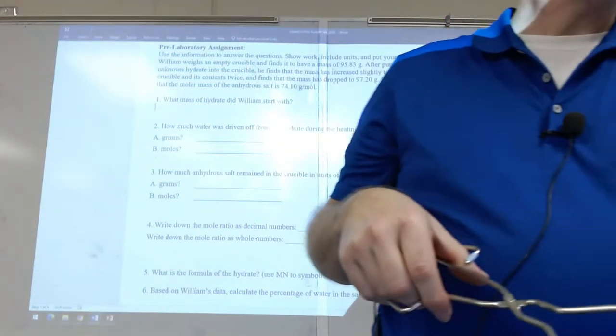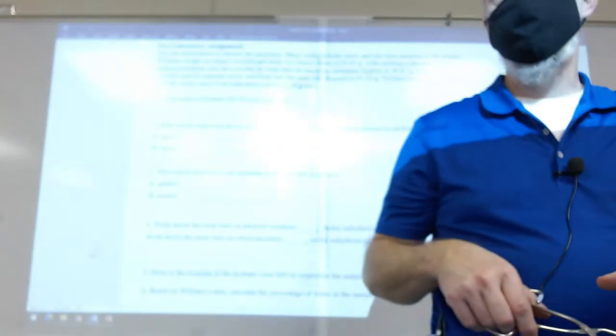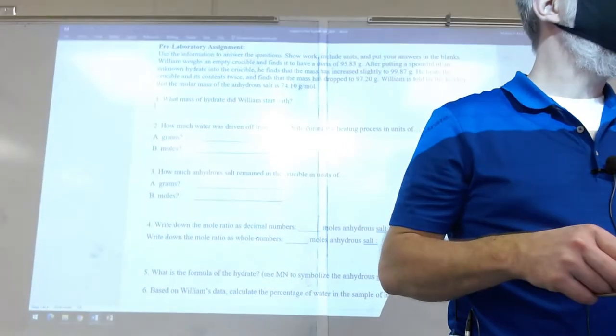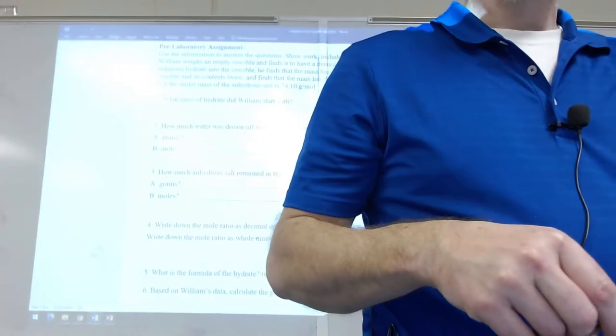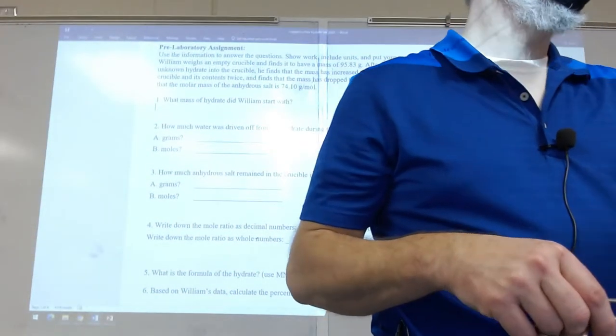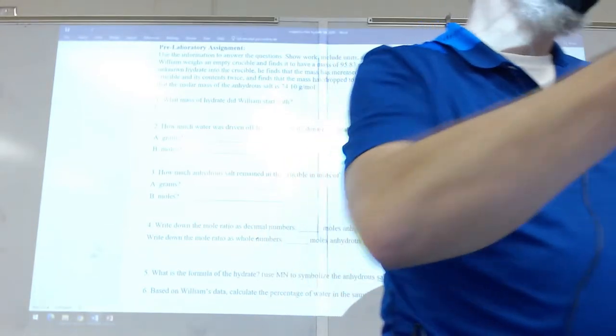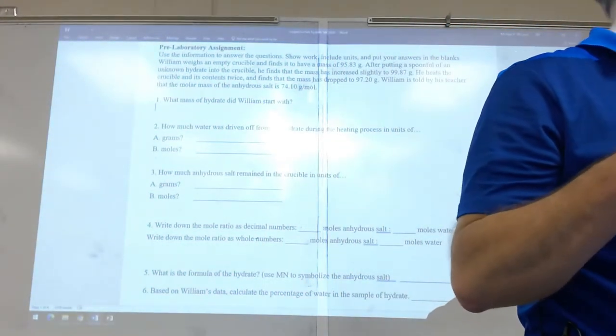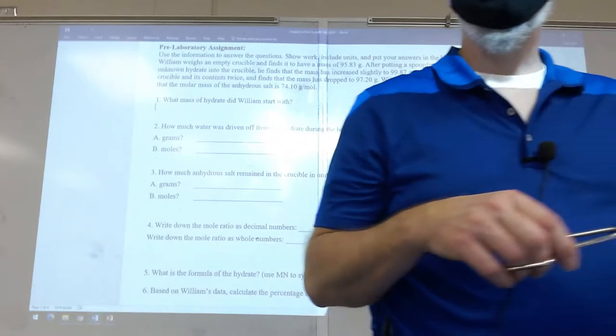We're not going to use a cover. That's a good question. We are not going to use a cover on this one. I want you to do some constant stirring, but we're not going to use a cover. There are labs, and if you watch some stuff online, you will see ones that have a cover. And so you have to take the cover off and work and put the cover back on. And that's okay. We're just not going to do that in this particular class.